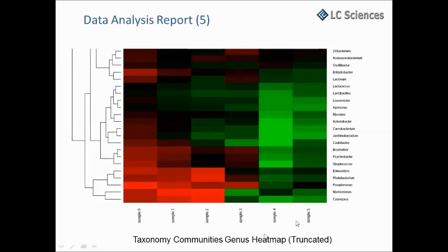By this method, if the samples are from different conditions, treated or untreated, we can do a good comparison among them and see which microorganism is highly abundant inside, and then we know the profiling of all these microorganisms inside the samples.